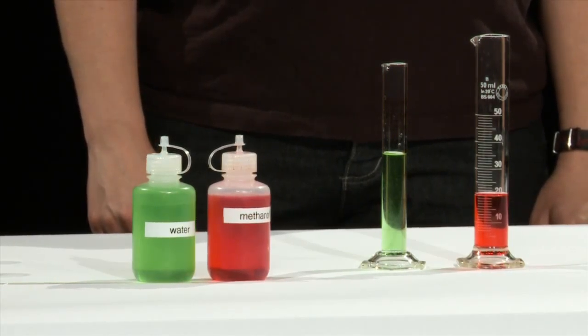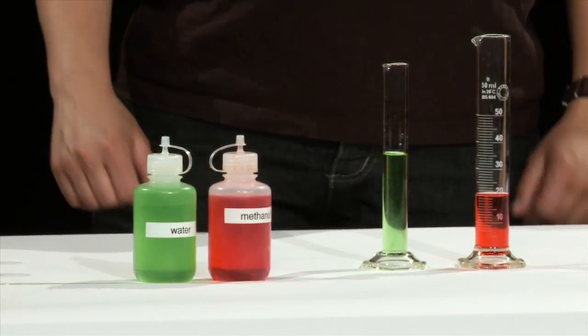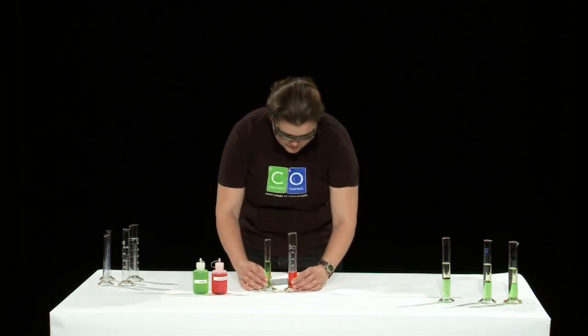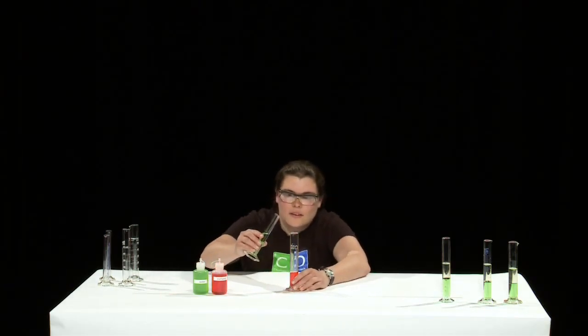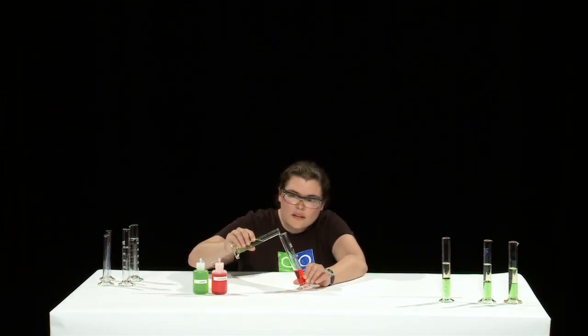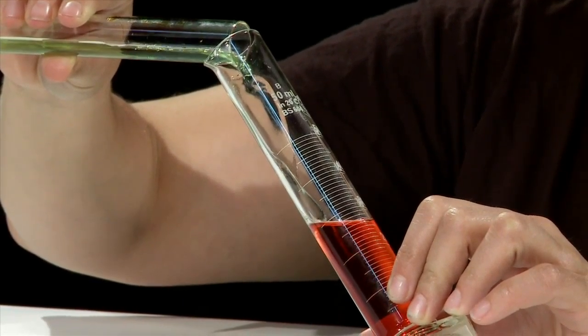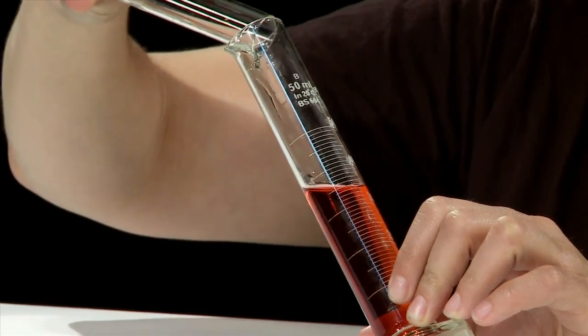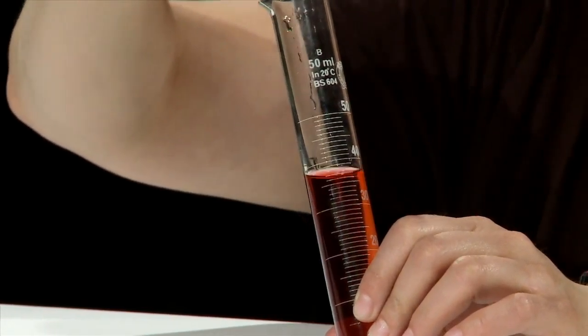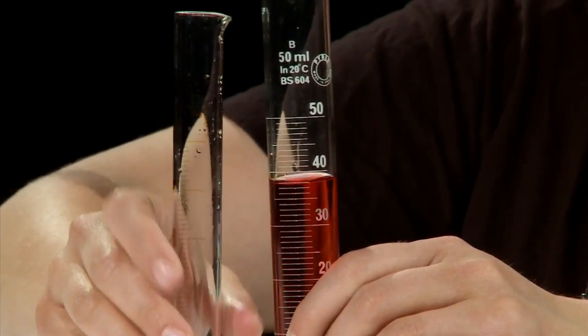So now the experiment is repeated with methanol instead of oil. Once again 20 milliliters of water has been measured out and then it is added to 20 milliliters of methanol. This time the two liquids mix to give one layer. This shows that those liquids are miscible.